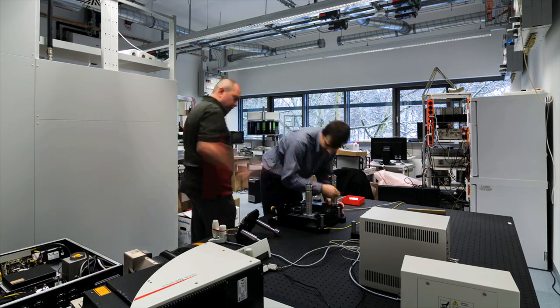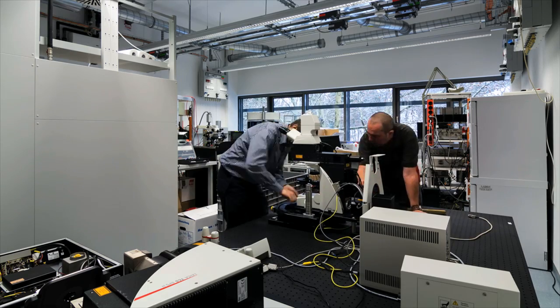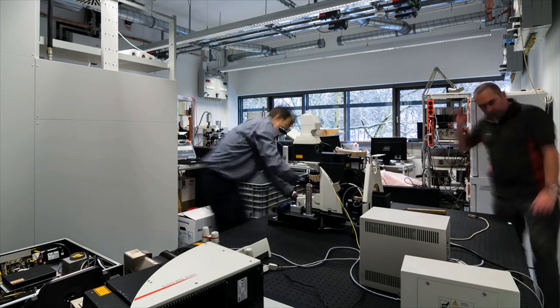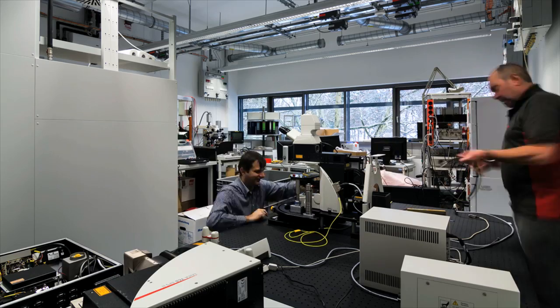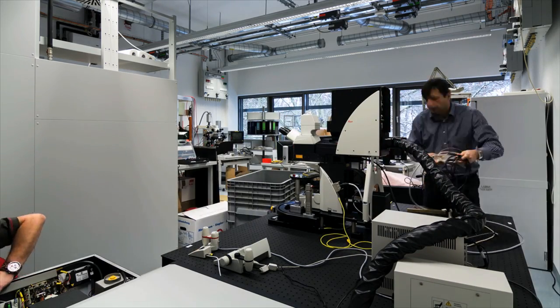And now on top of that, a high-resolution microscope is mounted with a confocal head that is positioned for resolving the subcellular processes of the cells.